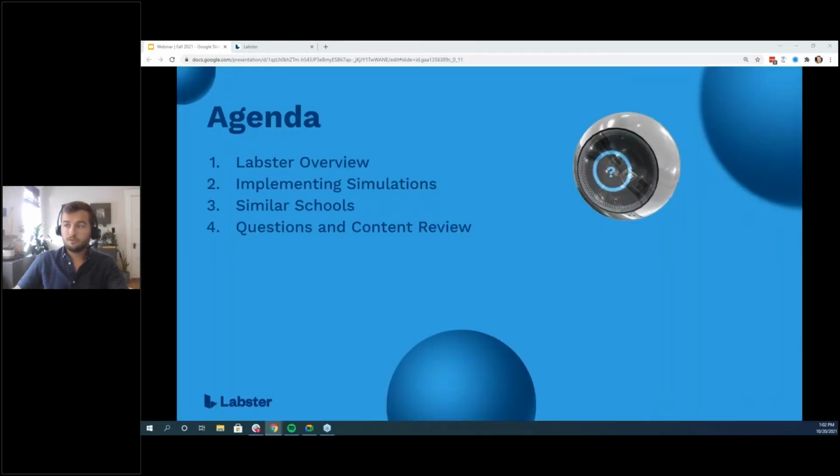All right, so we're going to go over a brief Labster overview. We're going to talk about some information on Labster, how we're used in different courses, and the impact that Labster has had on institutions throughout the globe. And then we'll quickly walk you through our content. Labster is known for our virtual labs, but we're so much more than that. And then I'll walk you through our ever-expanding platform. And then we'll go through questions and implementations, and then let you on your way.